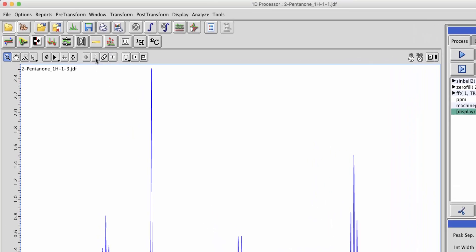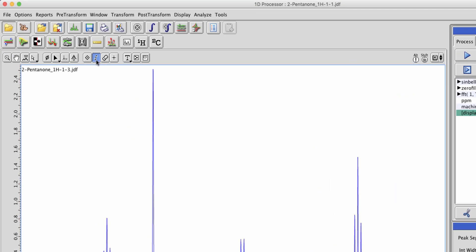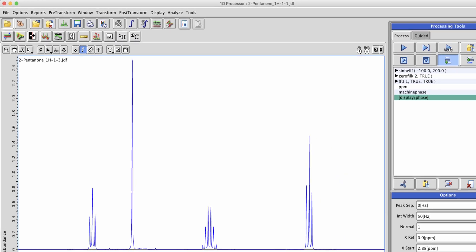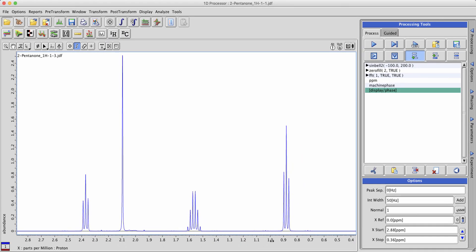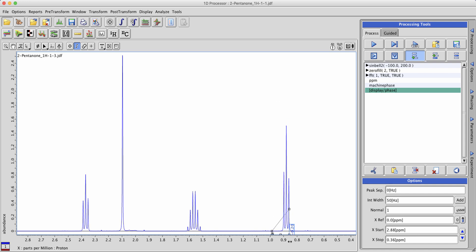To do this we'll select the create integral cursor from the cursor bar and left-click, hold the mouse button, and drag in order to define an integral region.